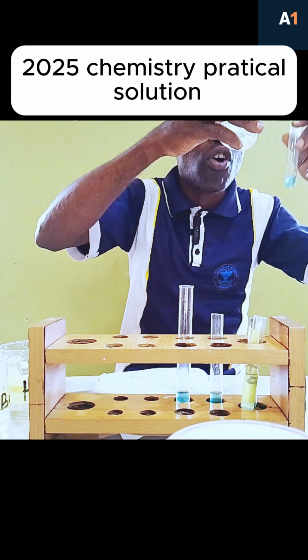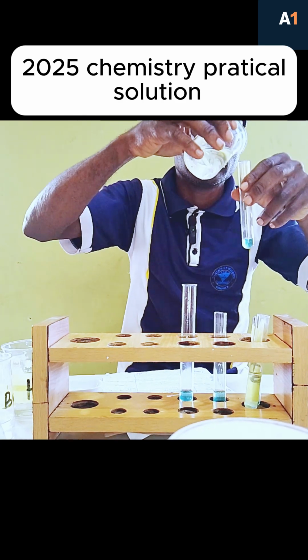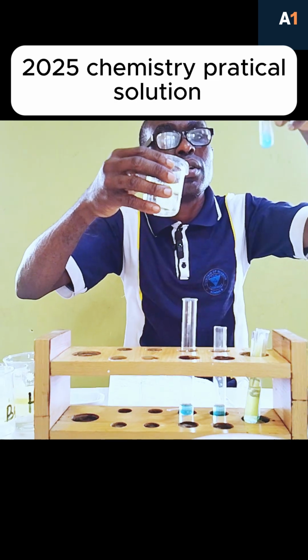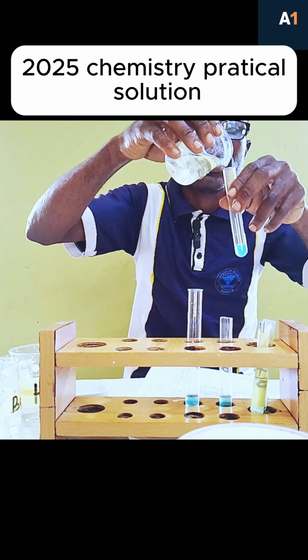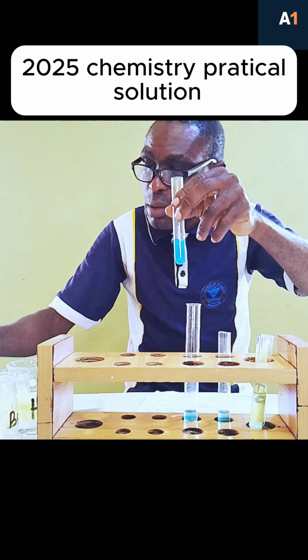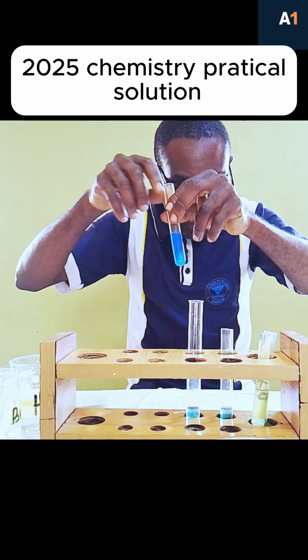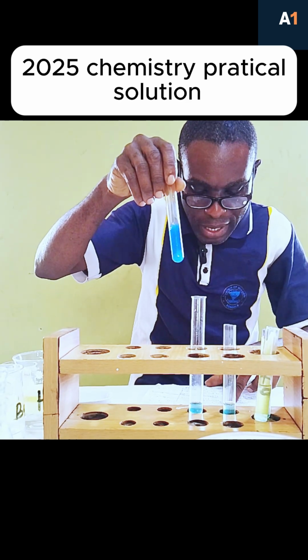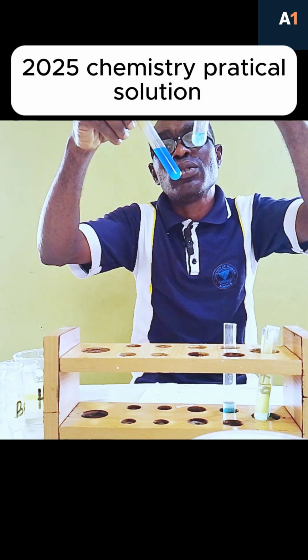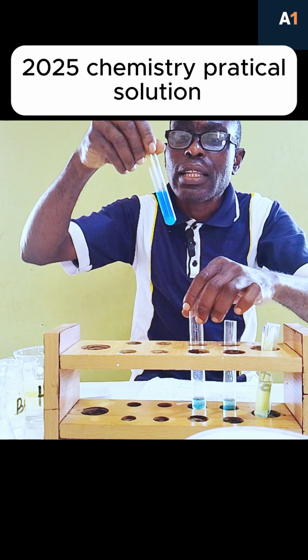We are asked to do it in drop, and I want you to compare what we are doing here with what I've just illustrated, whether it is true or not. In drop, this is in drop. Now in excess, let's see what will happen in excess. You can see change of color again to blue. Let me add more because it's excess. You can see what happened to the second portion in drop and in excess. Whatever you see is what you record. Now you can see that it is soluble.